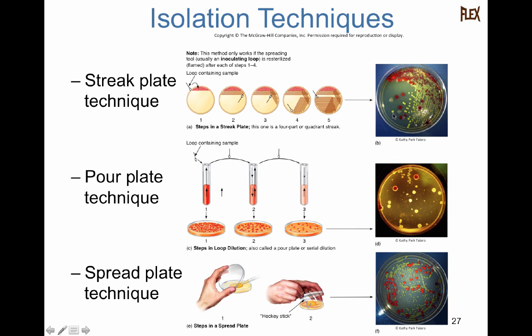So this bright yellow bacterial colony is a different species than this cream-colored colony and this red-colored colony as well. But right here, if we were to pick up some bacteria from this area of the plate, we would pick up 3 different types. Okay, so how do you actually isolate and separate these guys out?